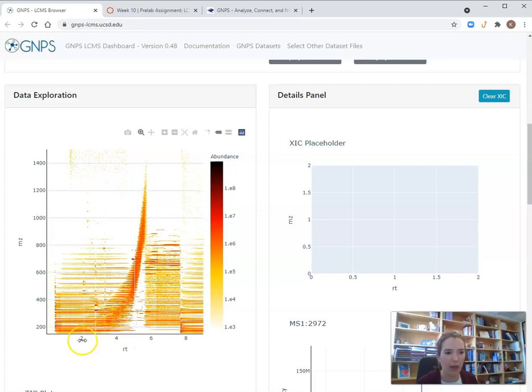total ion chromatogram. So you've got retention time along here, plus all the information contained in each of those mass spectra. Here's the mass to charge ratio along the y-axis. And what previously was the y-axis is now coming out towards the students as a heat map on the plot. I can also introduce the concept of the extracted ion chromatogram, or XIC.